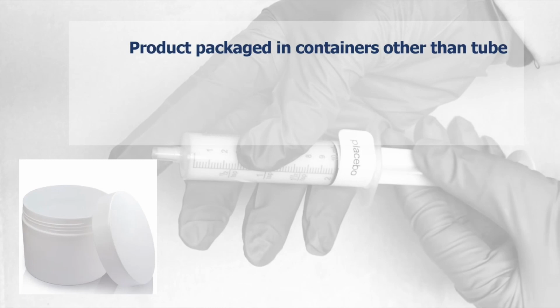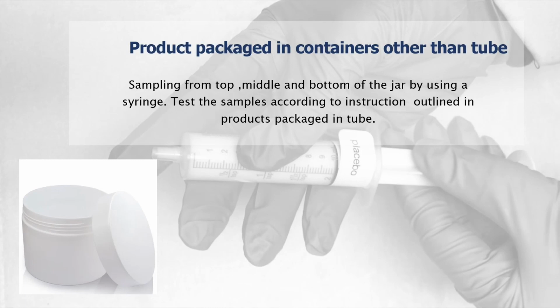Product packaged in container other than tube. Sample from top, middle, and bottom of the jar by using a syringe. Test the sample according to the instructions outlined for a product packaged in a tube.